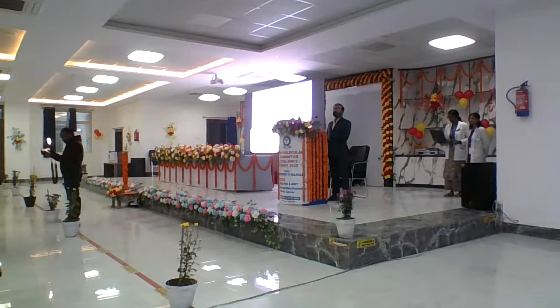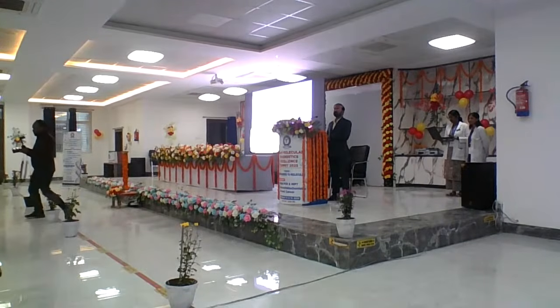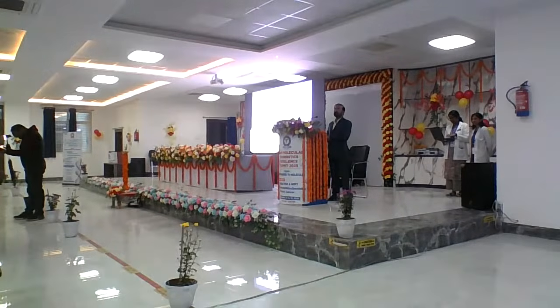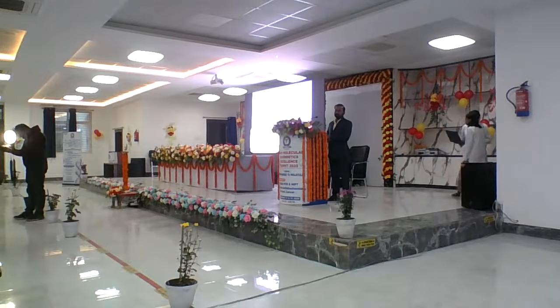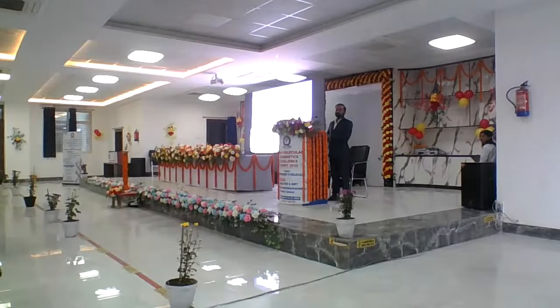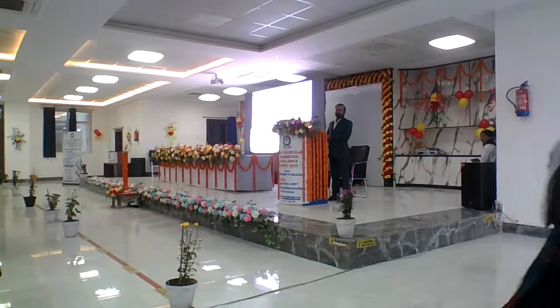That was a very nice presentation. You mentioned that one of the limitations is droplet generation errors, right? So the generator is claimed to generate around 20,000 droplets. But in reality, what is the number of acceptable droplets before you take a sample as positive?